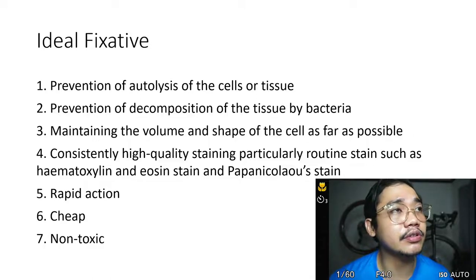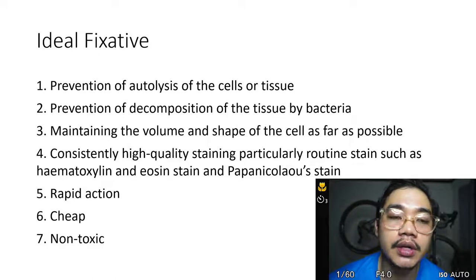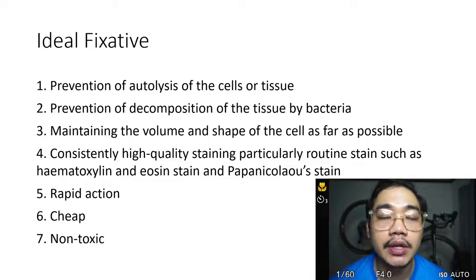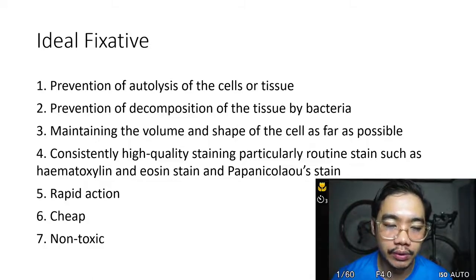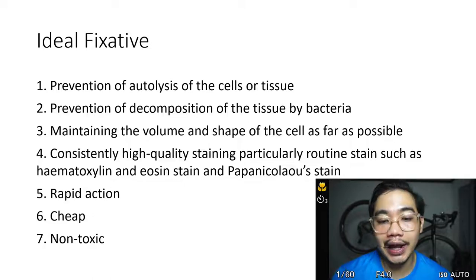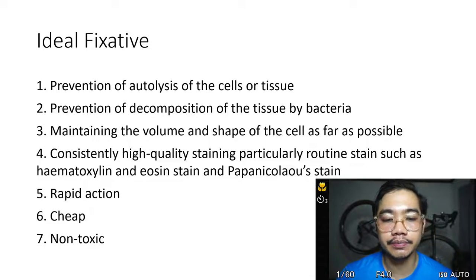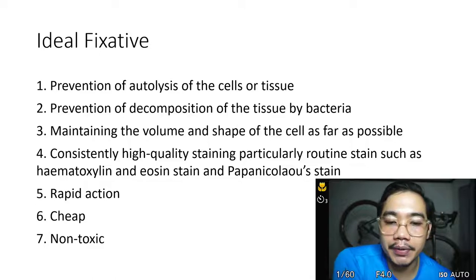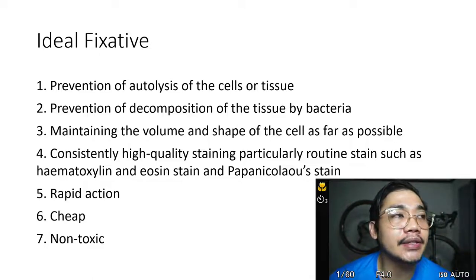So it poses a threat, but luckily, praise the Lord, most of the fixatives kill a wide spectrum of infectious agents, except one infectious agent, which we will talk about in a while. So they kill most bacteria, which will help, of course, in number two, to prevent the decomposition of bacteria, your putrefaction. They also kill your viruses, no? So your HIV, your hepatitis B viruses. But there is one thing that they cannot kill, no?